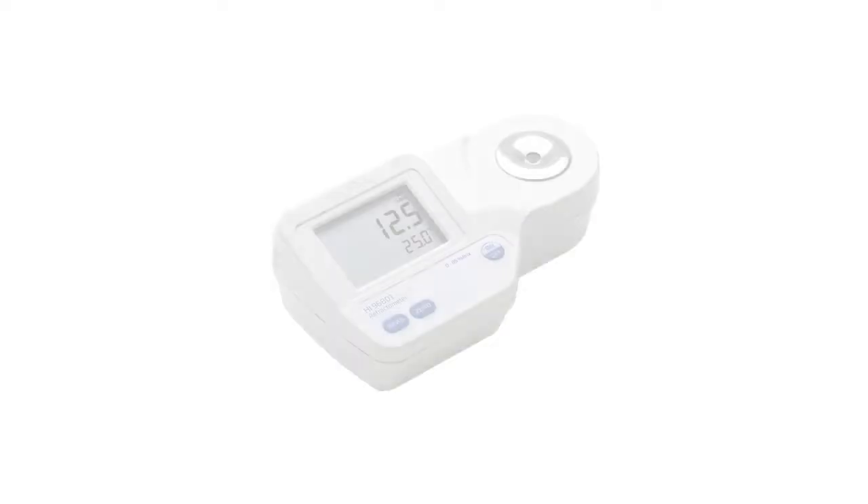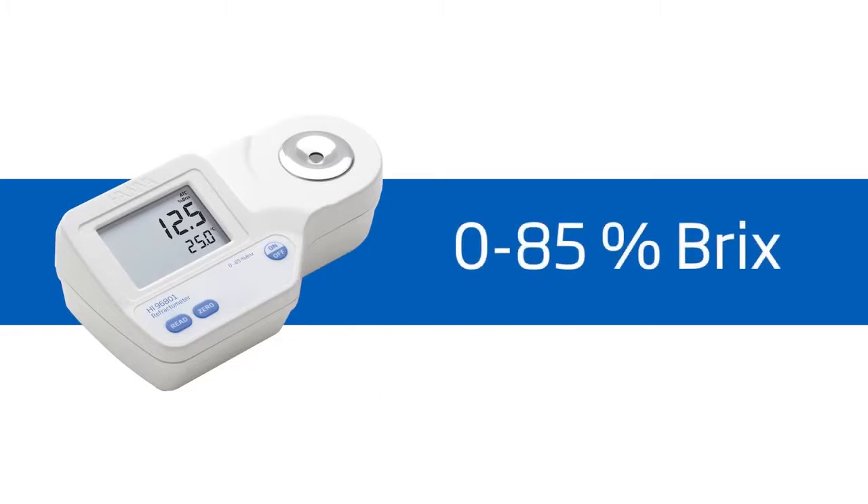Welcome to the HANA Lab. My name is Doug and today we'll be featuring the HANA HI96801 refractometer for brix and foods. This meter is ideal for food producers measuring sugar content. It offers high performance and eliminates uncertainty involved with mechanical refractometers, all at around $175.